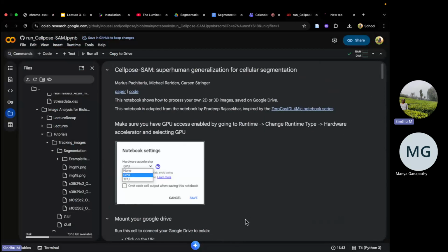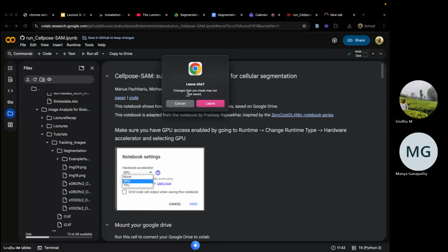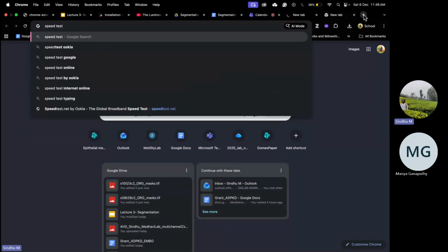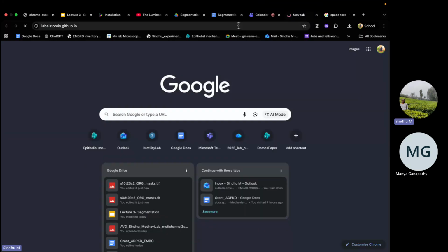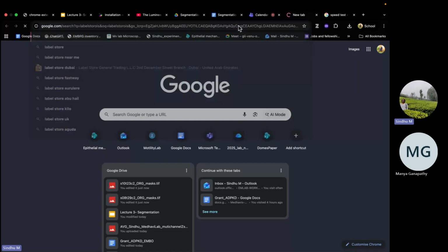So yeah, this is how you run Cellpose on Google Colab. Why is it? I don't know if my internet, like ISC Wi-Fi is slow. It is fine. So this is the name of the plugin called LabelsToROIs.